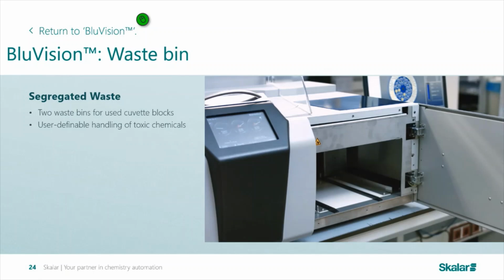So it's senseless to pay this premium for the disposal of relatively harmless waste. And just another mention of the overpressure exhaust system that we saw earlier in the presentation. This same mechanism is present in this section of the analyzer, and what that does is prevent re-entry of any fumes from our waste container. It prevents them from re-entering the reaction zone of the analyzer.